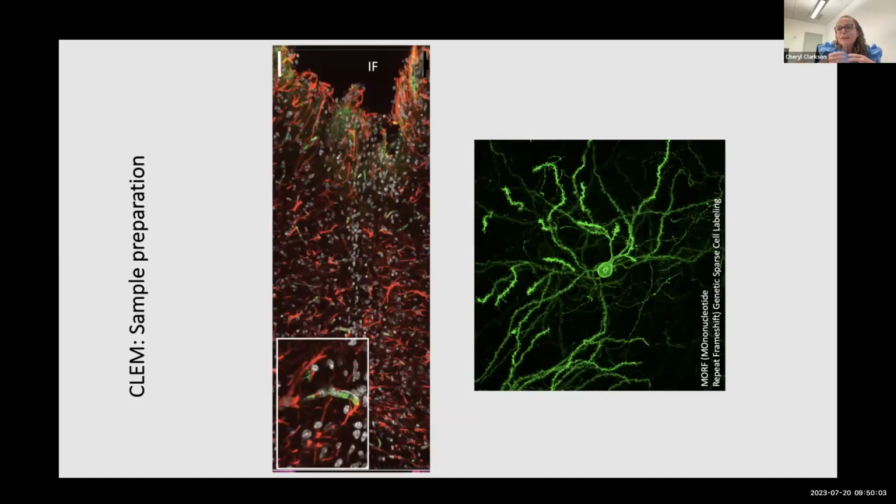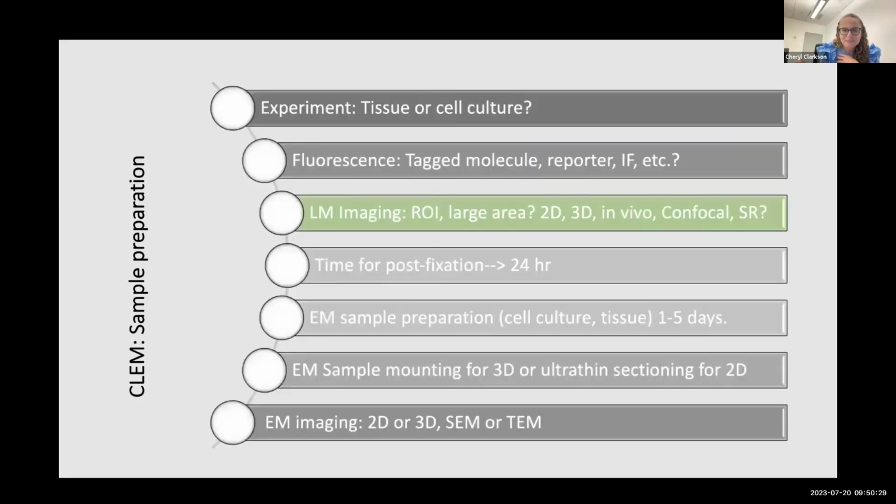When performing immunofluorescence, the idea is to be as gentle as you can with your Triton or your Tween, whatever you are using. And also the timing, because we are cutting 150, so as a tip it's a good idea to increase the incubation times for the primary and for the secondary antibody. That is my advice.